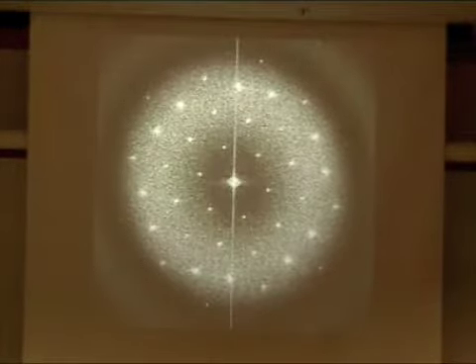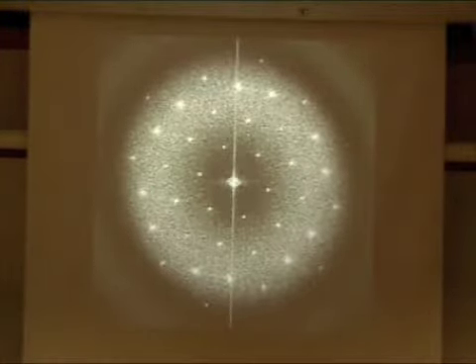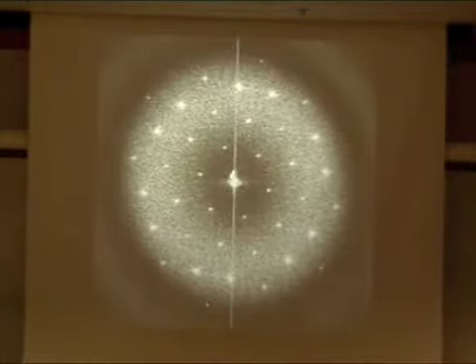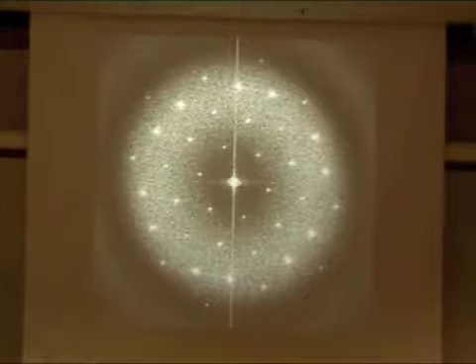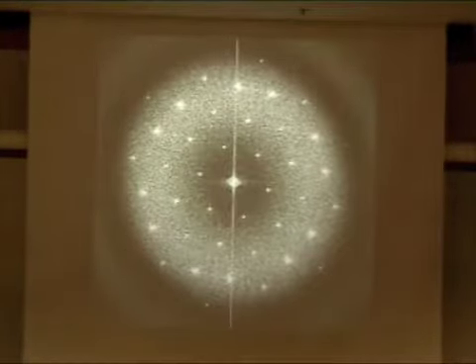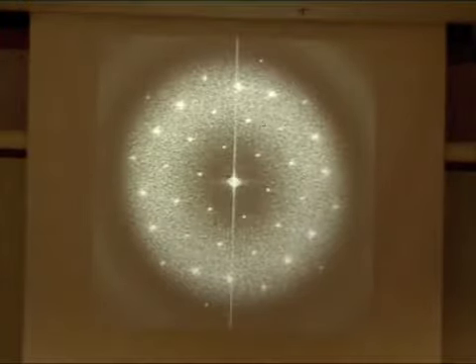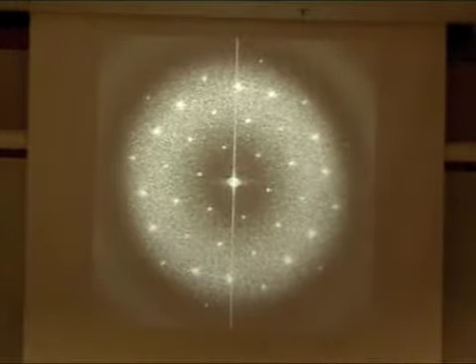Just pause for a moment and comment that another way of looking at this is that the whole goal is to take these little spots of information and push them all together into a coherent image. In fact, maybe a better way of looking at this is this array, if you ignore all the noise behind it, represents the little 64 by 64, or however many spots you have, picture in Fourier space of your image. So if you were to take just one little image of a protein, Fourier transform it, and then stretch it out, put a bunch of space in between, you get this exact thing. So the number of spots you have is equal, in a sense, to the number of pixels you have. Of course, it's not exactly that, because you have an angle here that isn't exactly 90 degrees, but we can think of it that way.